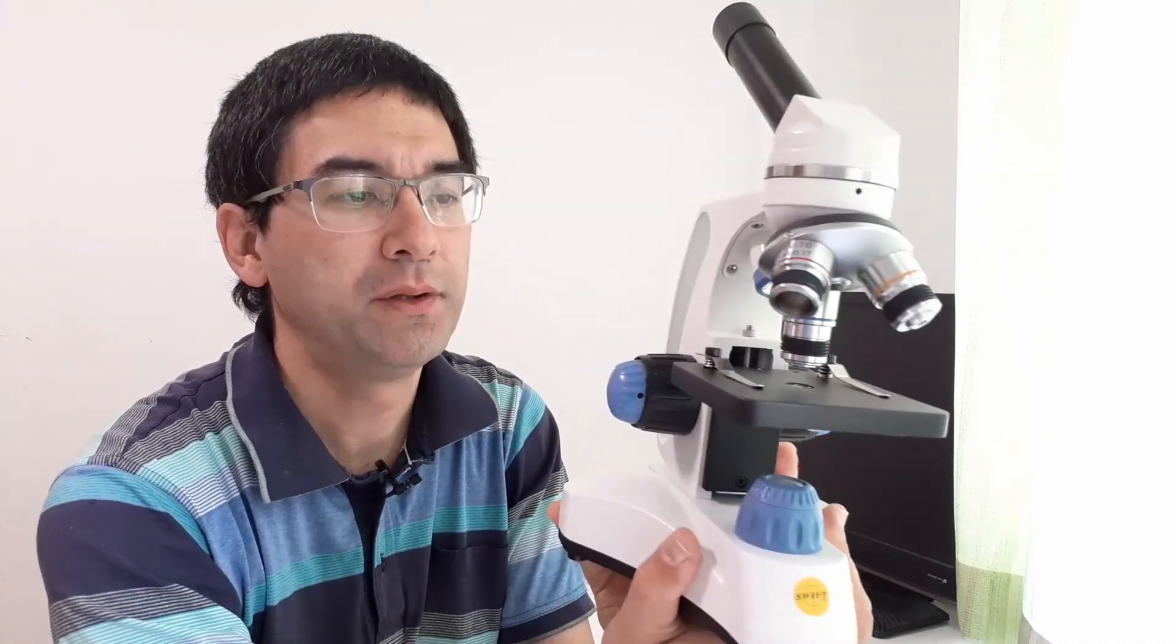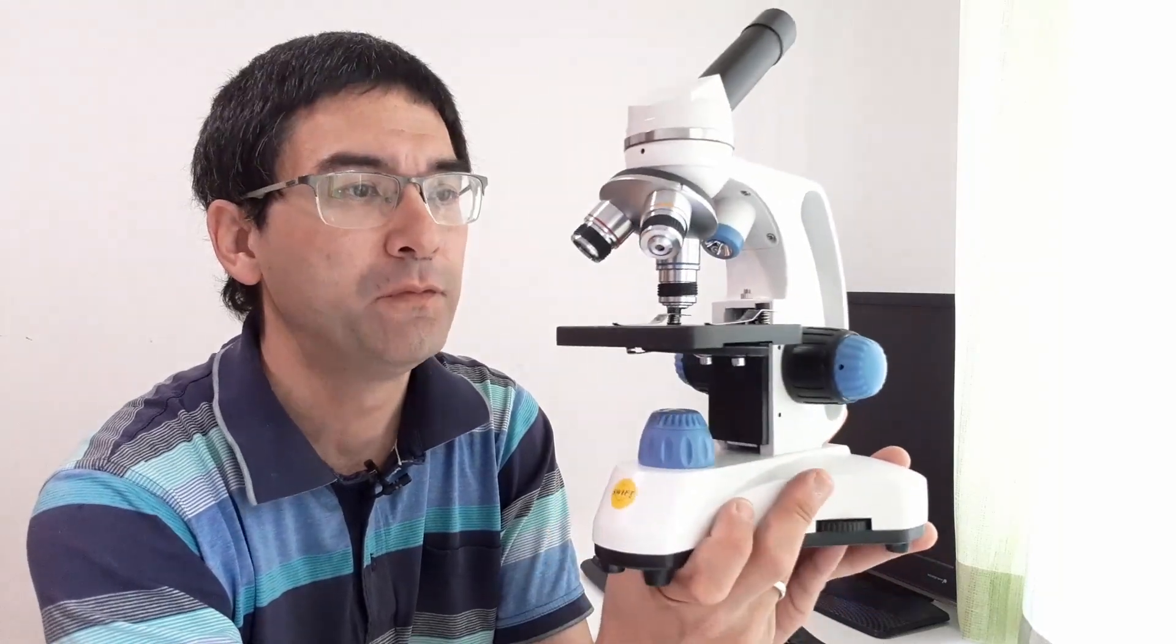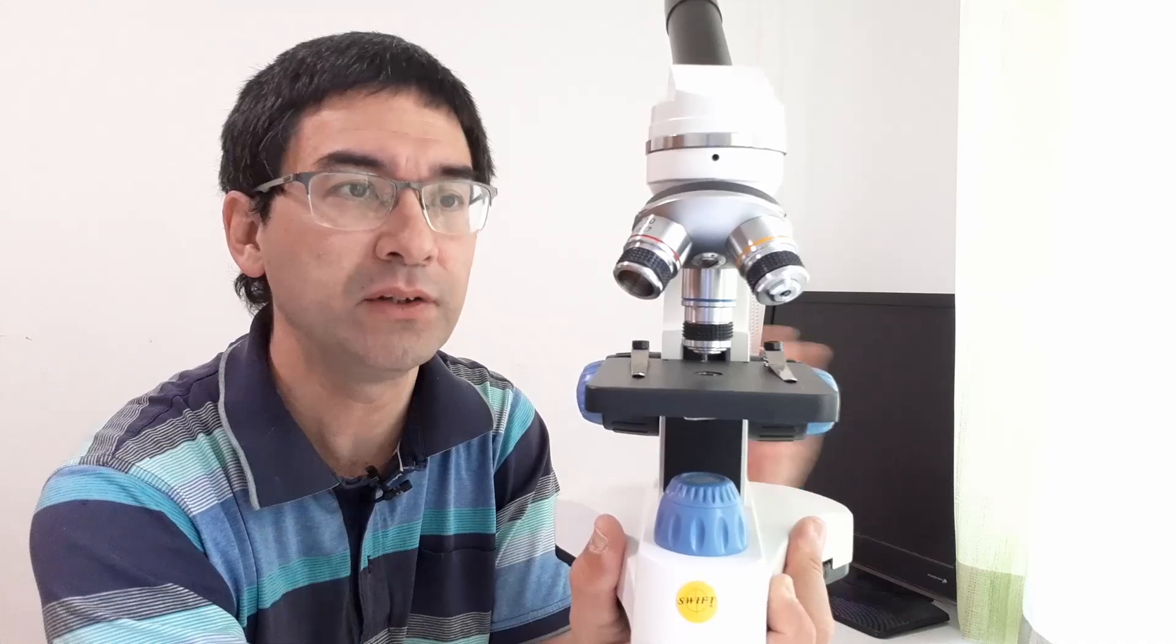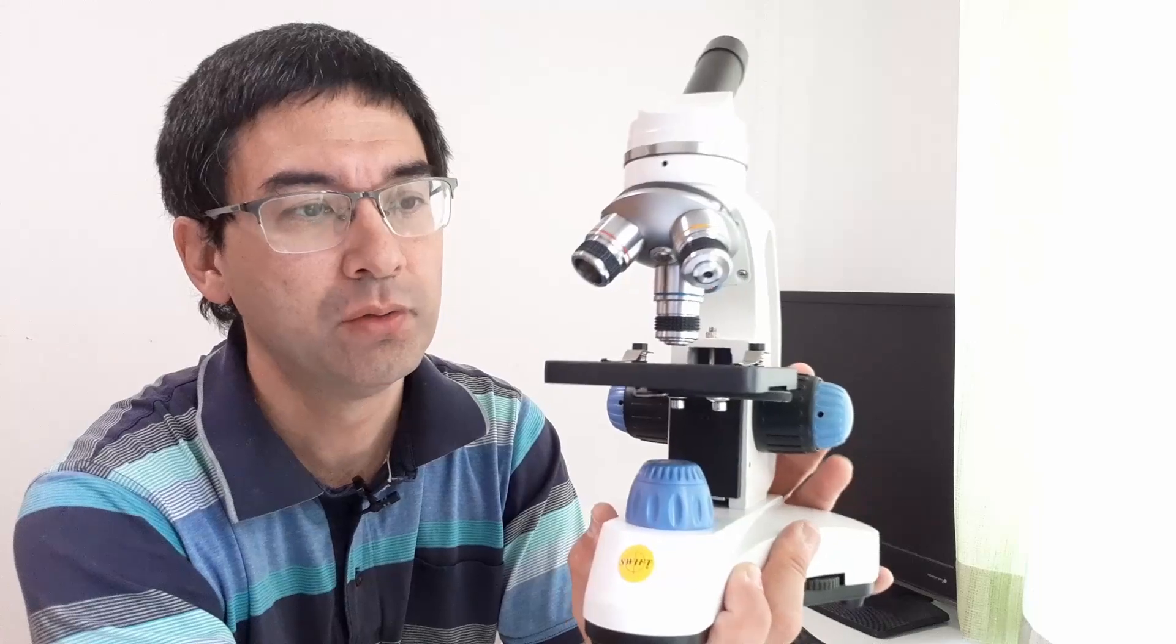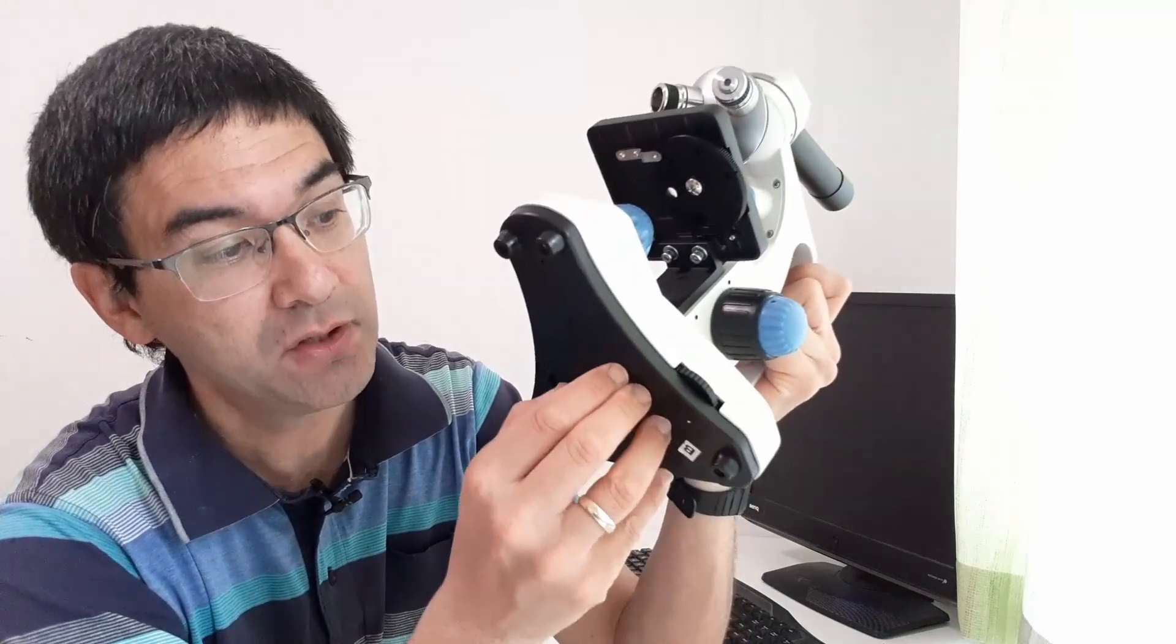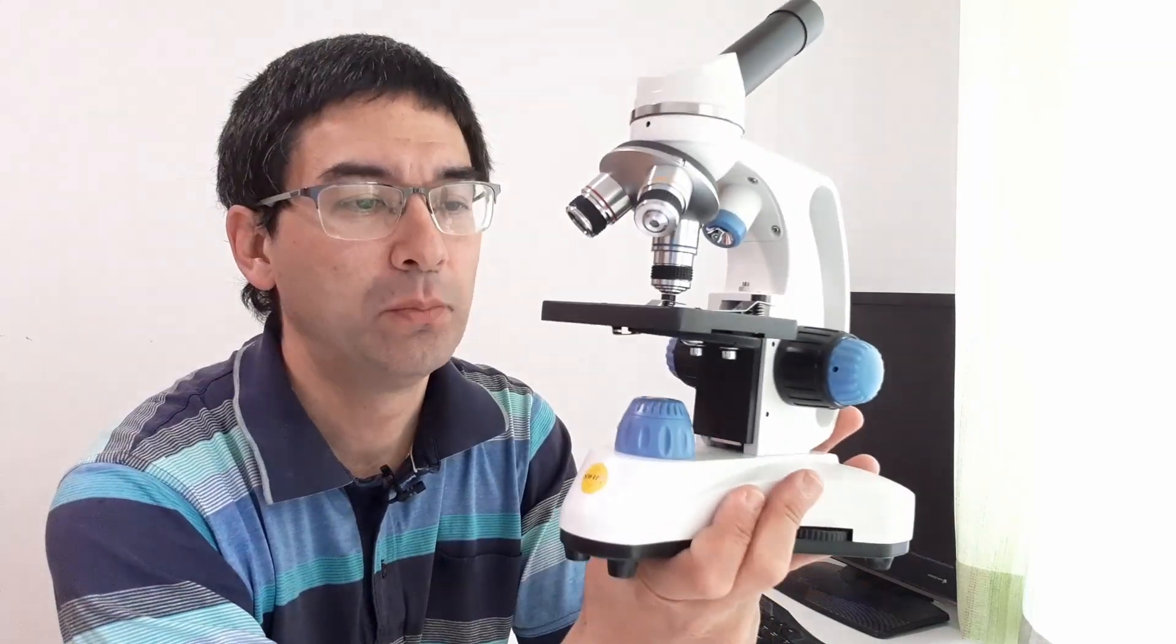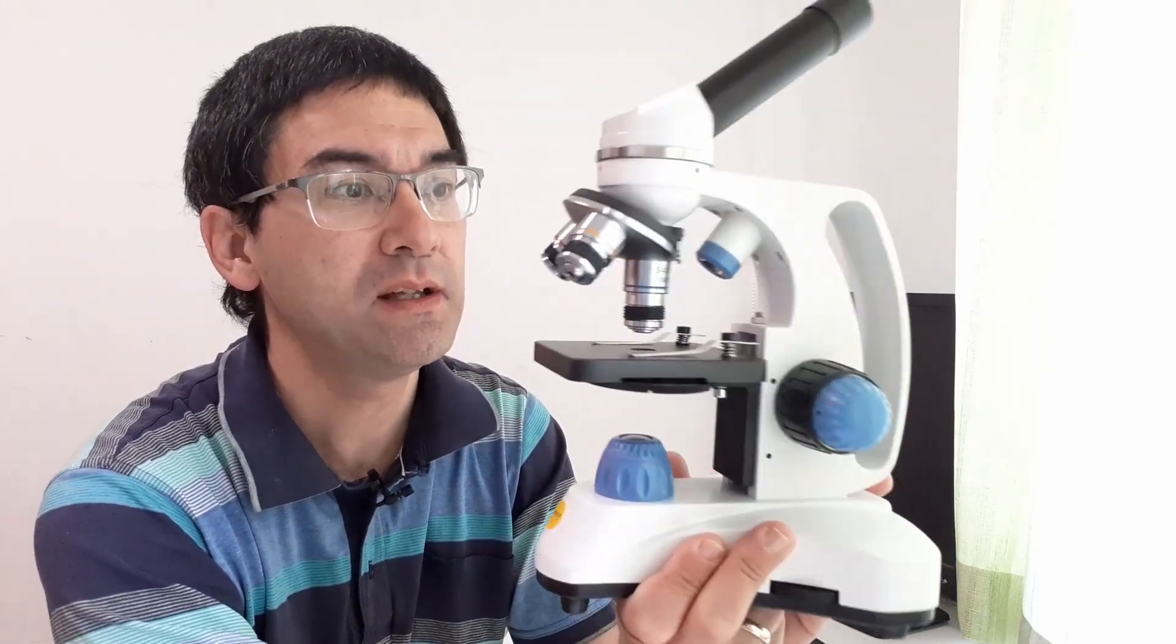So who is the microscope for? Well there are a few target groups that I can think of. First of all, anyone who would like to have a small travel microscope or maybe a field microscope where you want to take it out into the field to quickly observe some observations under the microscope. I can also imagine if you go on an excursion with students. The reason why this is an advantage is of course because there's a battery compartment in here. There are three batteries in here and this of course makes the microscope not only portable but independent of any power supply. So anyone who needs a field microscope.